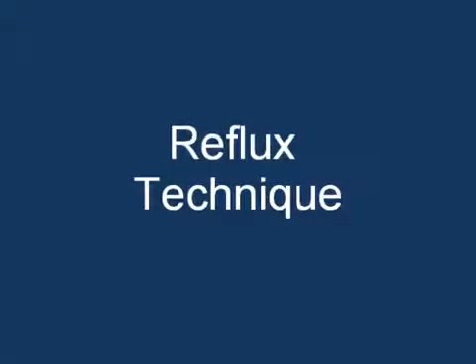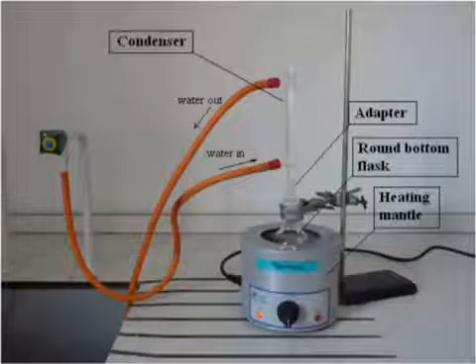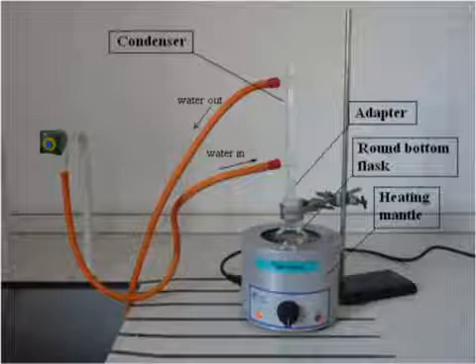The technique of refluxing is used when a reaction needs to be heated at a boiling point for more than a few minutes. The reflux apparatus consists of a condenser attached to a reaction vessel, usually a round bottom flask.